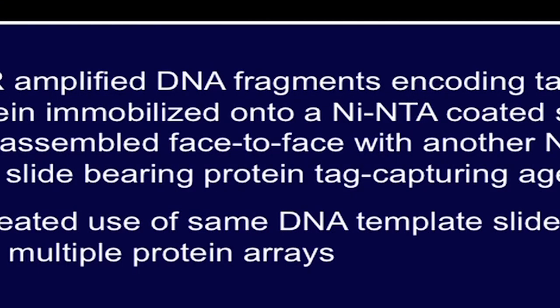Let us now discuss DNA array to protein arrays or DAPA. The DAPA technique makes possible the repeated use of DNA template site for printing multiple rounds of protein arrays. So, from the same DNA template, multiple protein slides can be produced. In DAPA, the PCR amplified DNA fragments which encode tag proteins are immobilized onto a nickel NTA coated slide and assembled face to face with another nickel NTA slide bearing protein tag capturing agent. The repeated use of the same DNA template can be performed here, and multiple protein arrays can be generated.